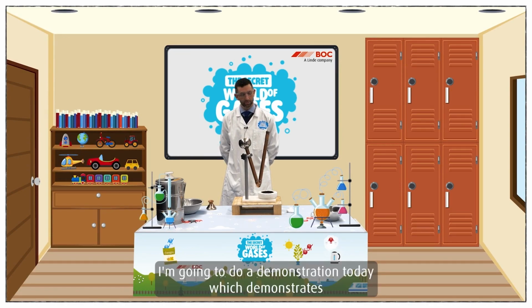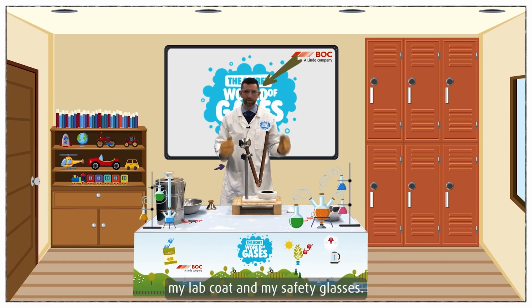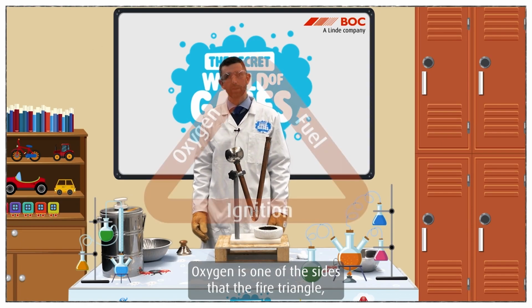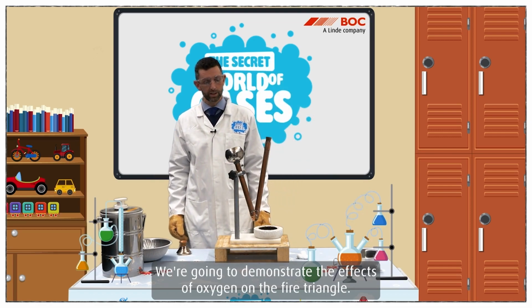I'm going to do a demonstration today which demonstrates the properties of oxygen. Before we get started with that, I'll be wearing my cryogenic gloves, my lab coat and my safety glasses. So oxygen is one of the sides of the fire triangle, the other two sides being fuel and ignition. So we're going to demonstrate the effects of oxygen on that fire triangle.